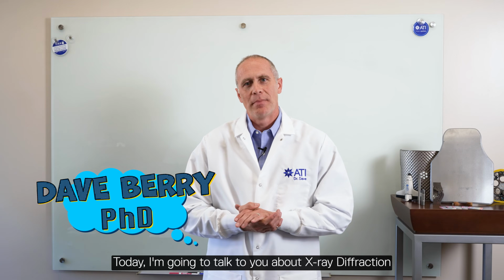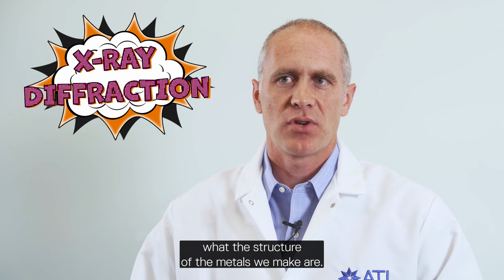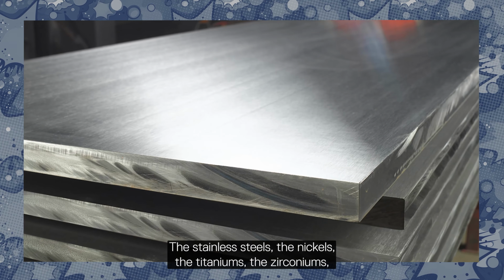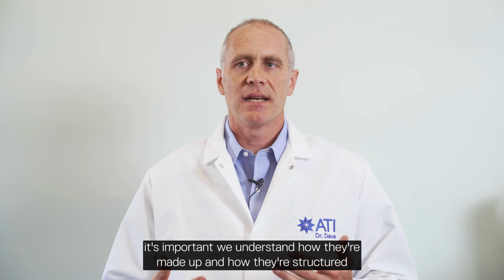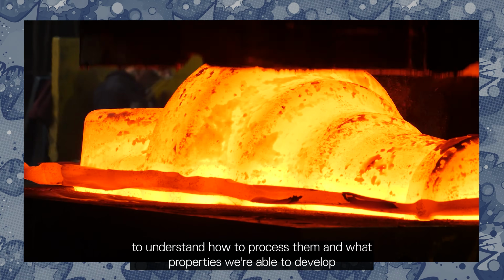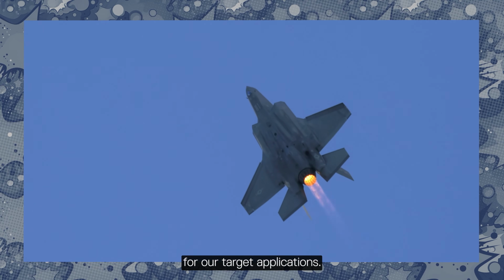Today I'm going to talk to you about X-ray diffraction and how we use that to understand what the structure of the metals we make are. The stainless steels, the nickels, the titaniums, the zirconiums, it's important we understand how they're made up and how they're structured to understand how to process them and what properties we're able to develop for our target applications.